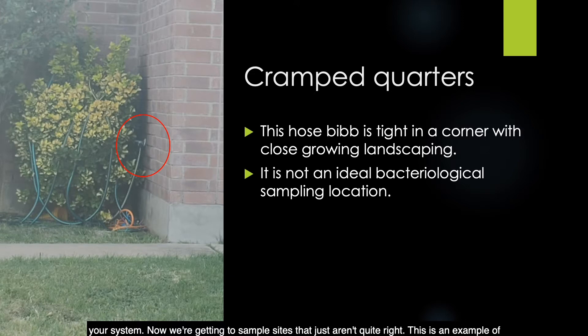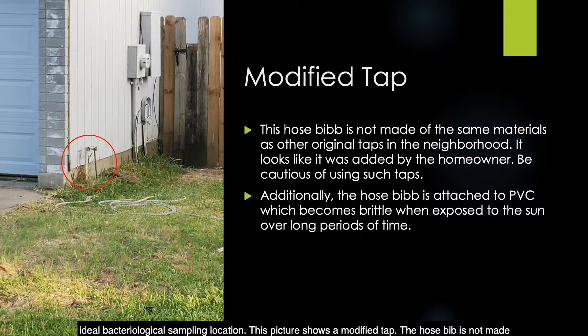Now we're getting to sample sites that just aren't quite right. This is an example of cramped quarters — the hose bib is tight in a corner and close to growing landscaping, making it not an ideal bacteriological sampling location. This next picture shows a modified tap — the hose bib is not made of the same materials as other original taps in the neighborhood and looks like it was added by the homeowner. Be cautious of using such taps. Additionally, the hose bib is attached to PVC, which becomes brittle when exposed to the sun over long periods of time.